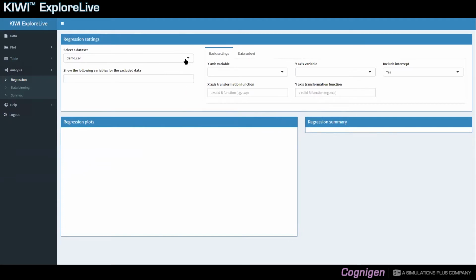In the regression settings, you should start by selecting the data source. In this first field, you can view a list of all the data sets that you have imported. It will also list the modified data set that you may have created in the data submodule. And it will show the pool data if you have merged or pooled two data sets together in this data module. So in our example, I will select the 1 per ID data set.